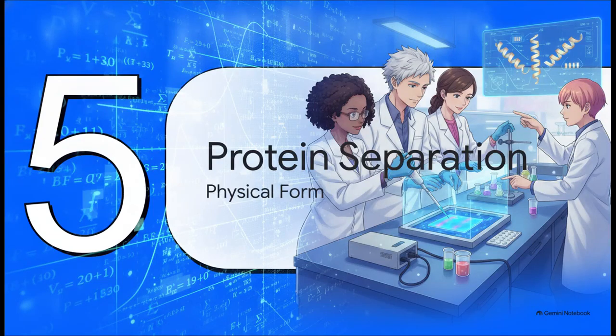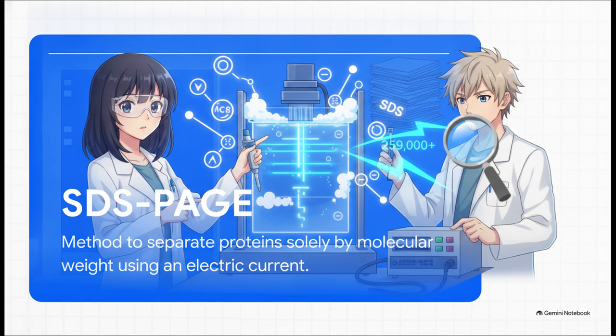Section 5. Protein separation via SDS-PAGE, physical form. All right, so we've mastered the mathematical function. Now we're shifting gears to the physical form, on the laboratory bench. If kinetics tells us how a protein acts, electrophoresis tells us what it actually is, structurally speaking. SDS-PAGE is an absolute game changer.